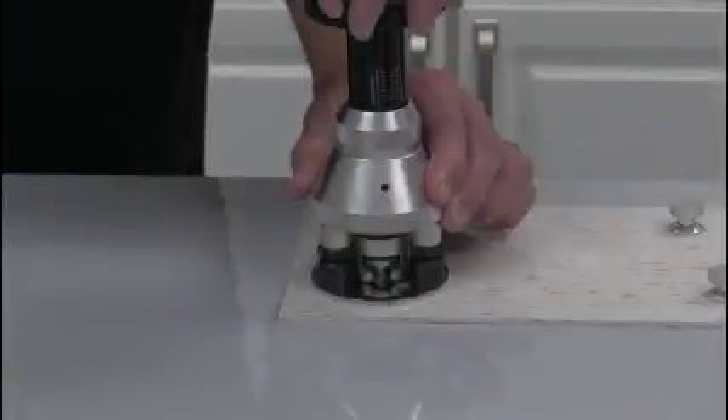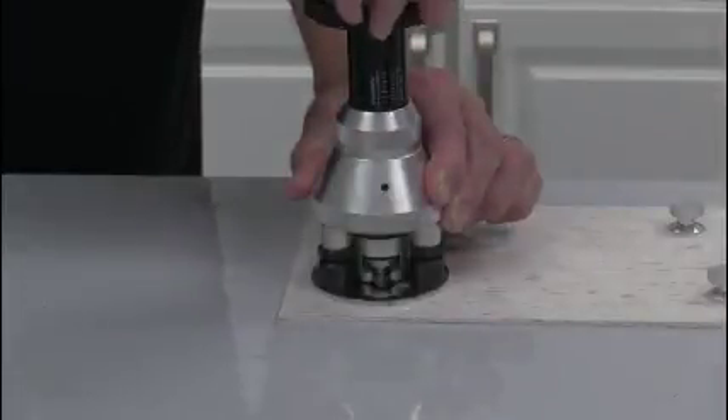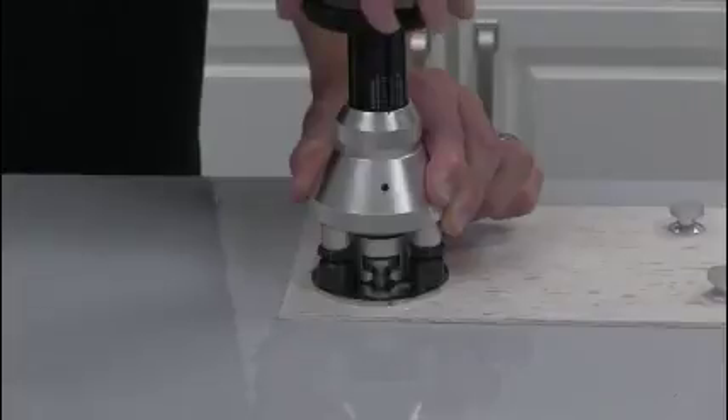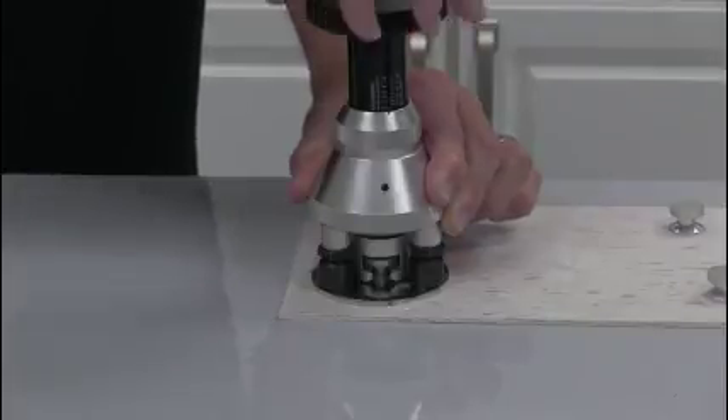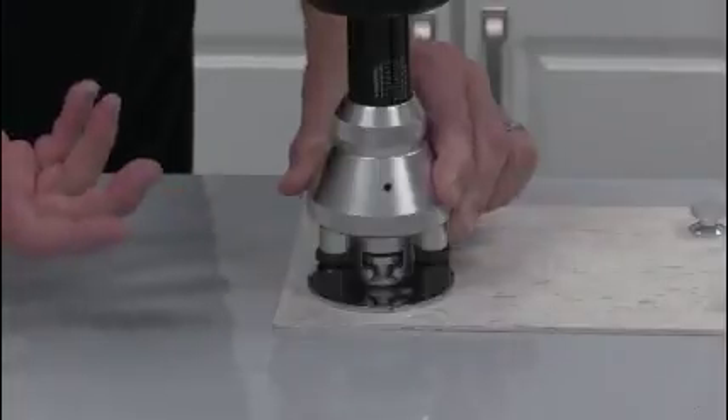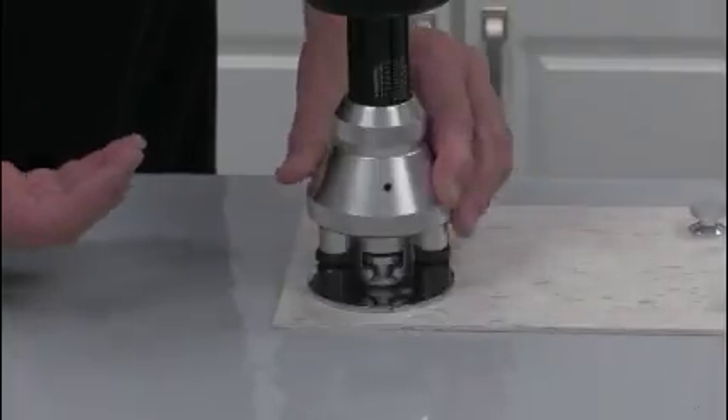We're going to start turning this, slowly exerting force on the dolly. That noise indicates that we've pulled the dolly away from the substrate.